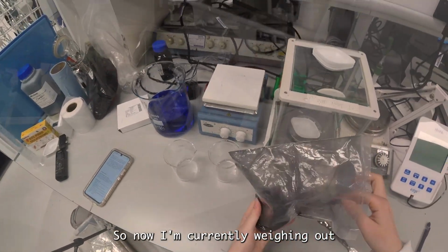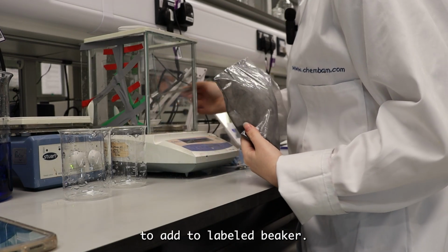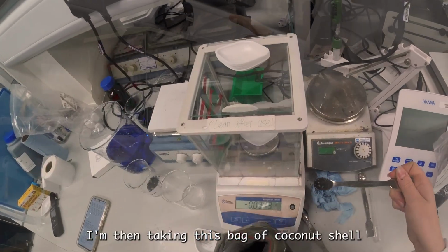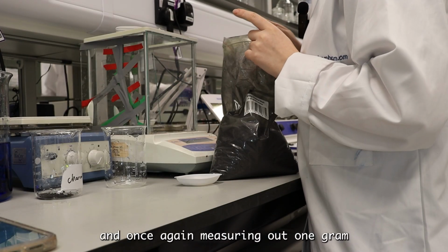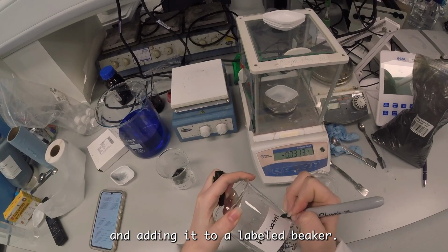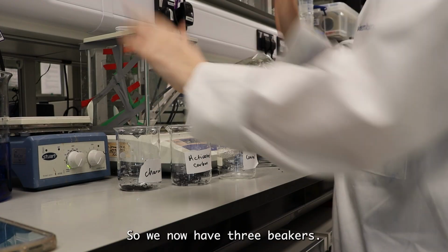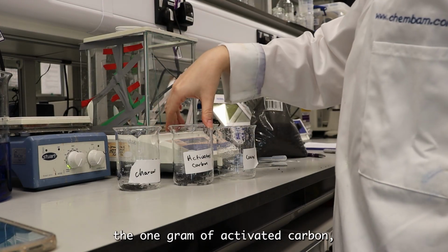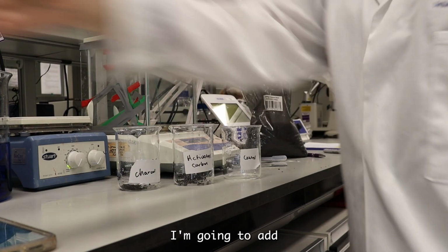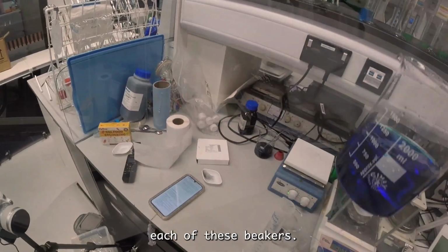So now I'm currently weighing out 1 gram of charcoal to add to a labelled beaker. I'm then taking this bag of coconut shell activated carbon and once again measuring out 1 gram and adding it to a labelled beaker. So we now have 3 beakers, the 1 gram of charcoal, the 1 gram of activated carbon and the control, which is currently empty. And I'm going to add 100 milliliters of the methyl blue solution to each of these beakers.